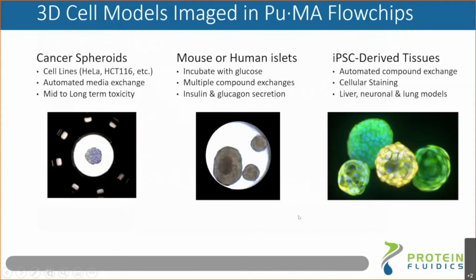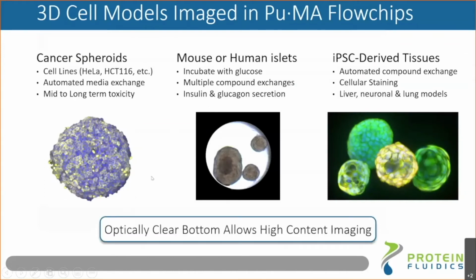He shows examples of the imaging. In a number of microfluidic devices, you have trouble imaging through them just because they have PDMS or other plastics, which are really not amenable to good optical transmission. In this case, we have COC bottom sealing chips, so you can do very high resolution imaging. This is the 20x water immersion lens.